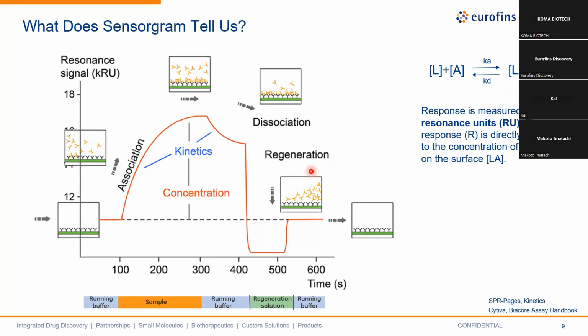And the response we see is the increase of this analyte bound on the surface, the increase of the complex formation. Okay, this is the principle of SPR and how you interpret its sensorgram.